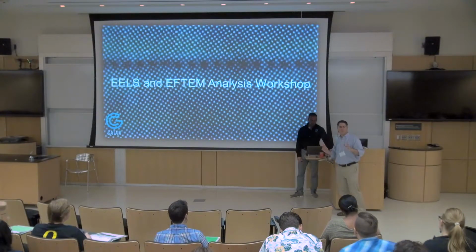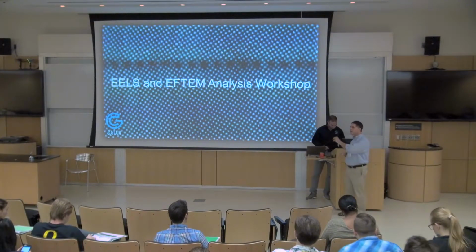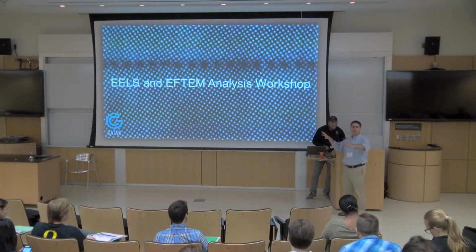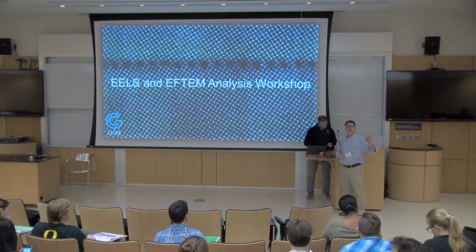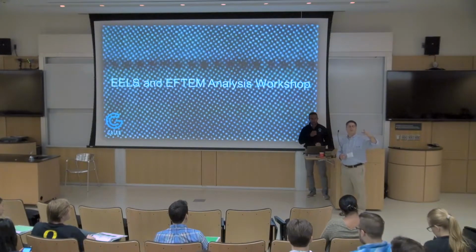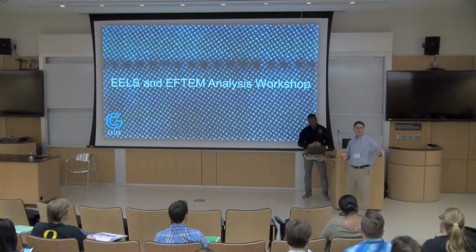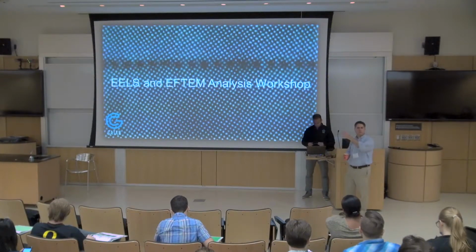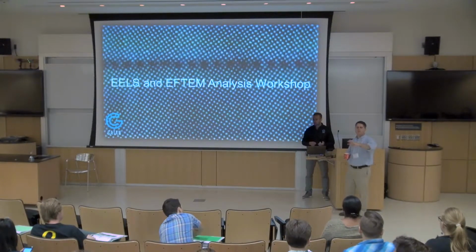So we've got 2 lectures this morning on EELS. Paolo is going to give us a broad overview. Then the next lecture is going to be on calculating the EELS fine structure, which is determining the valence of these spectra. And we're going to follow up with more EELS lectures on Wednesday. And tomorrow we're going to stop and do tomography, the 3D imaging.